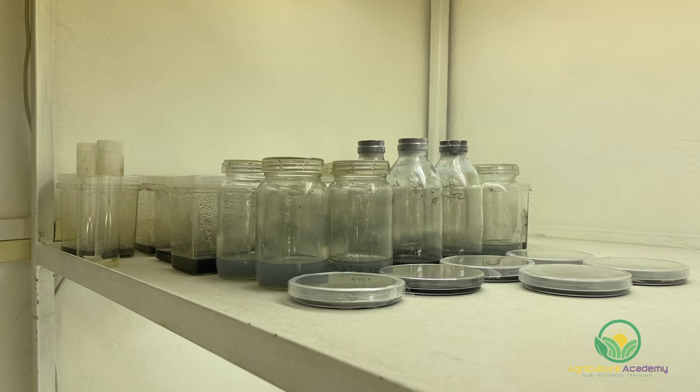We wrapped all our jars, petri dishes and pots with cling film and kept them under UV lights. With Cymbidiums, germination should begin in about 3 weeks or so.